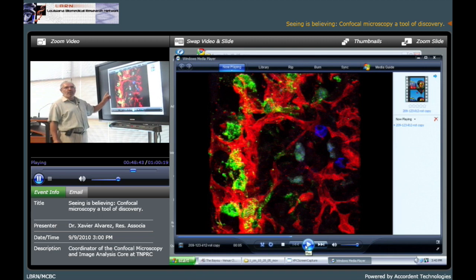This is at the point where the cells come into the lymph node. The cells that are all armed show a lot of the red; they have IL-3 receptors in order to check the cells that are coming through. This is the marker that we are using to detect.